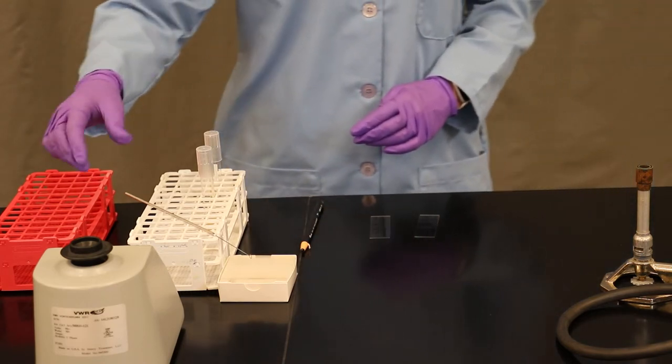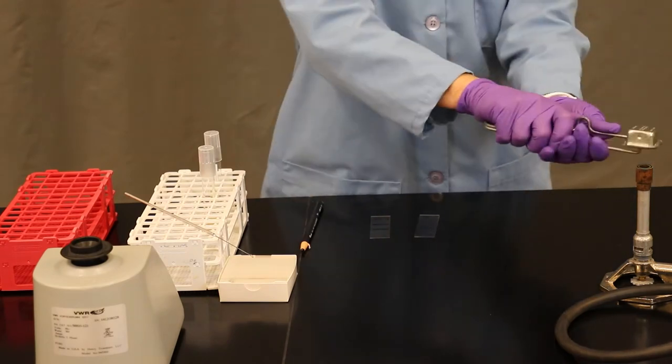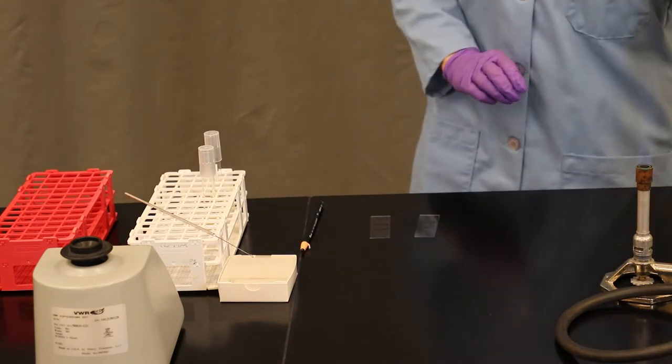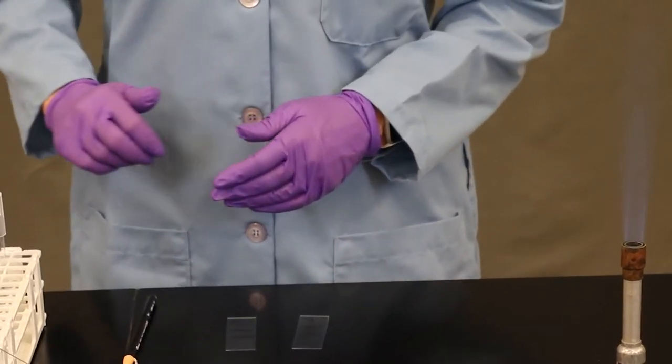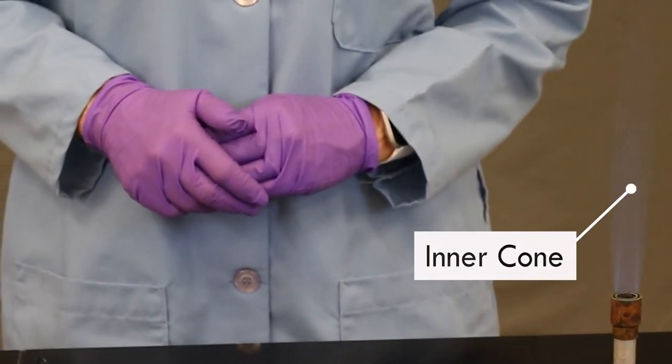Now it's time to get your Bunsen burner set. Turn on the gas valve. Your Bunsen burner should have two blue cones. The inner cone is the hottest portion and the portion you'll be working with.